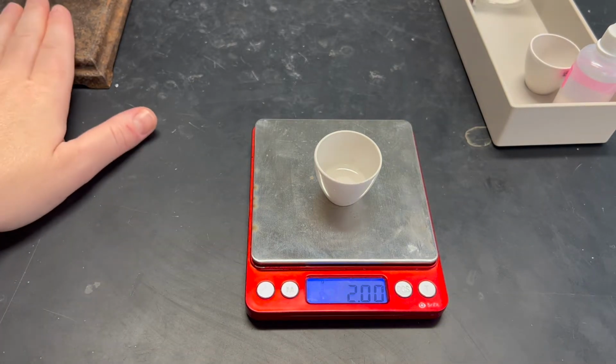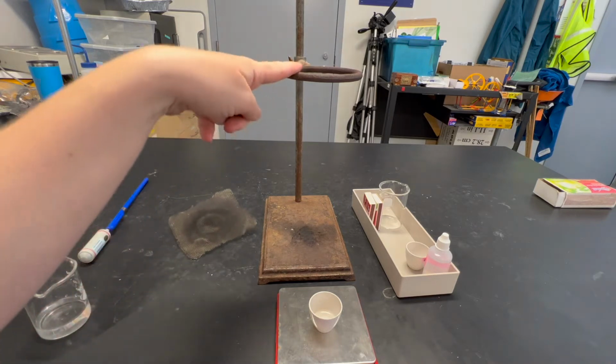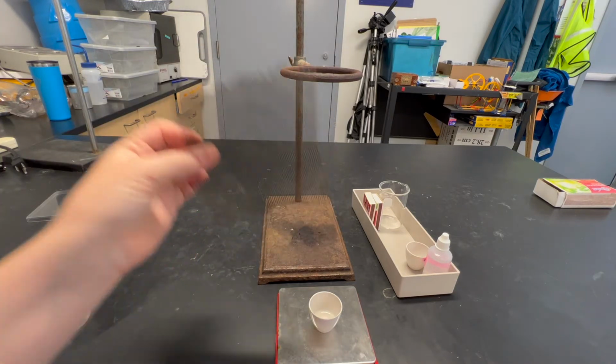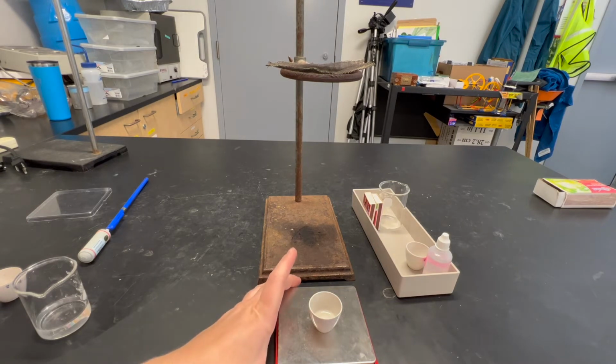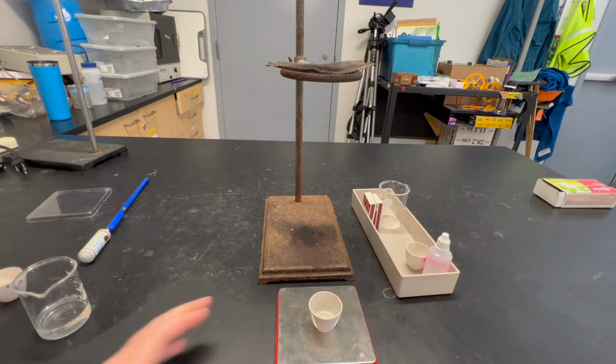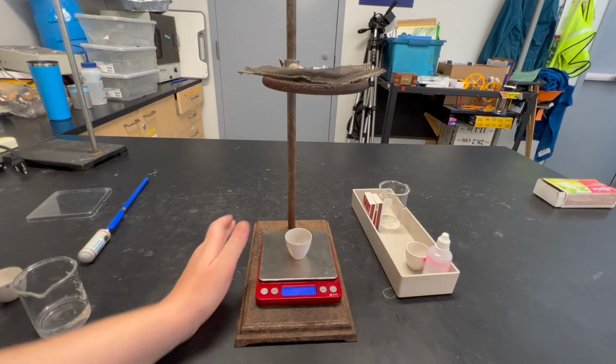Now we need to set up our ring stand. Every group will have a ring stand with a ring on it and a wire screen. The wire screen goes on top of the ring, and on top of the ring is going to go your water, and under the ring is going to go my scale with the ethanol.